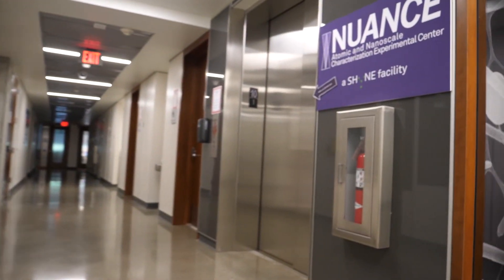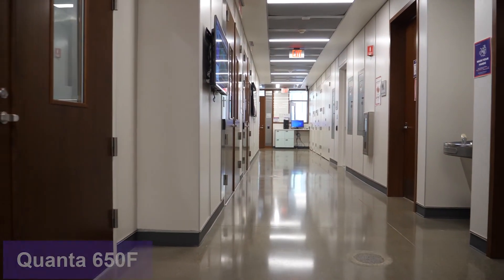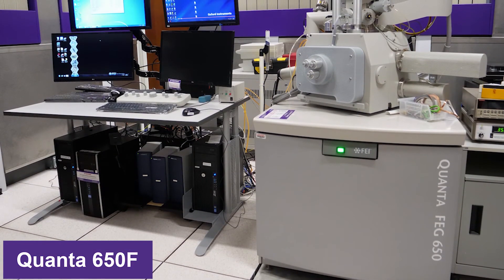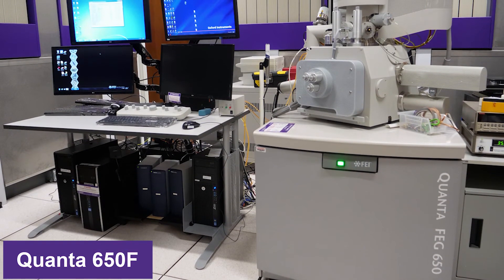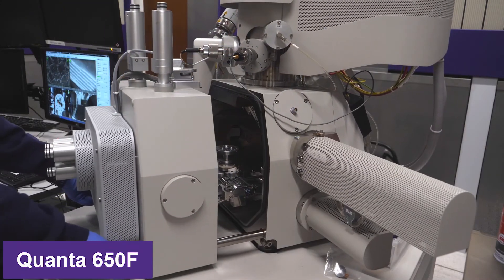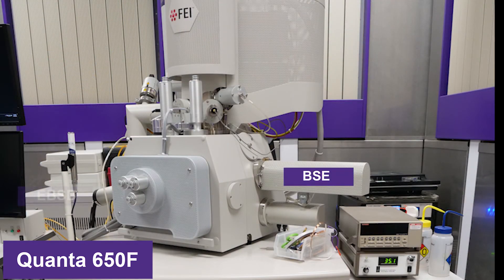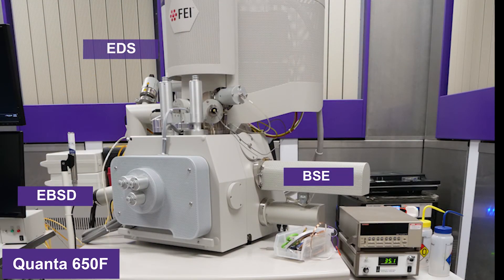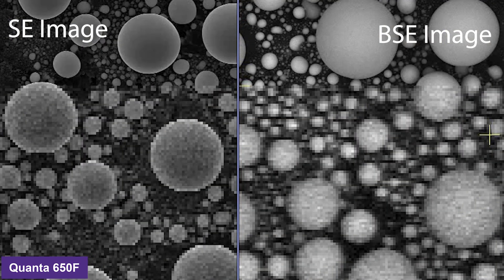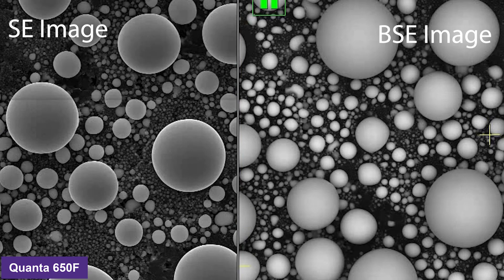Most of the other SEMs in the EPIC lab are located on the ground floor of the AB wing. The first microscope you'll see on the ground floor is the FEI QUANTA 650F SEM. The QUANTA can perform a number of advanced SEM techniques. It is equipped with a dedicated backscattered electron detector, an EBSD detector, and an EDS detector. The QUANTA allows you to scan an SE image and a backscattered electron image simultaneously.